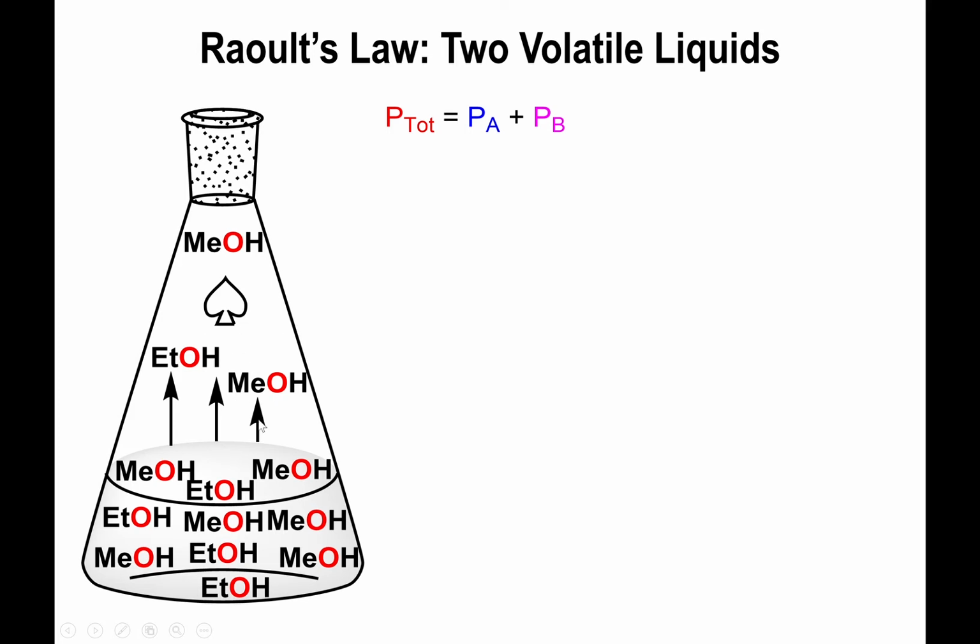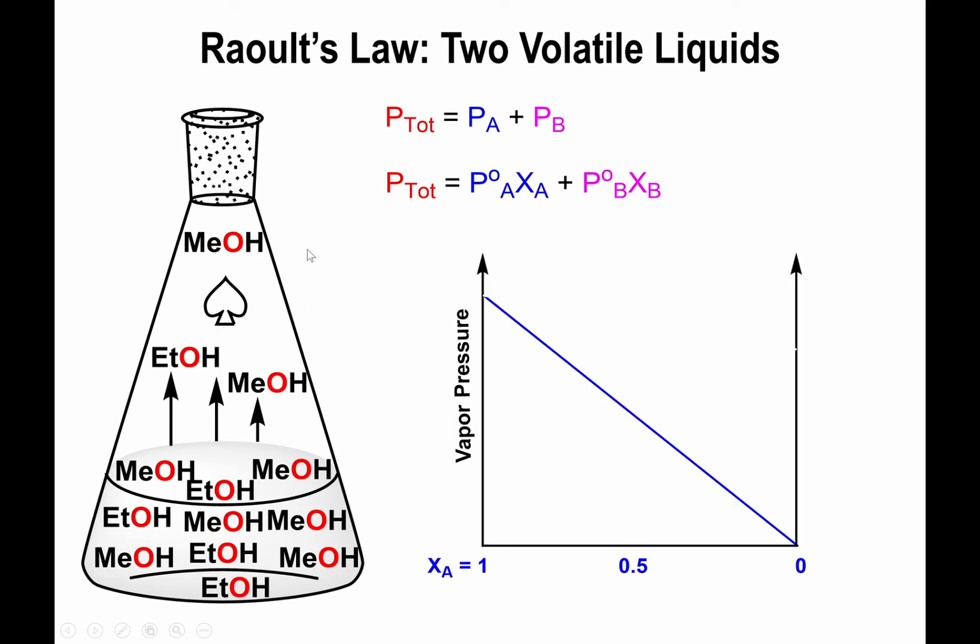But this is the deal: if these two substances have different boiling points, it is possible to separate them. You will create a vapor pressure associated with both of them, but we're going to exploit the boiling points. And the way this works, you might remember these equations from Raoult's law. You get a partial vapor pressure from one of the substances, you get another one from the second one, and you get your total vapor pressure for the combination of both.